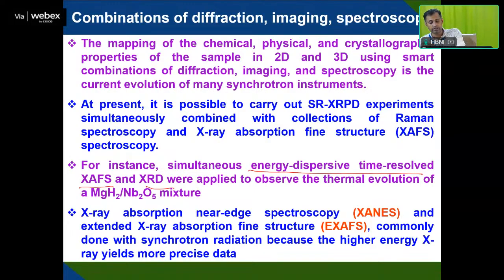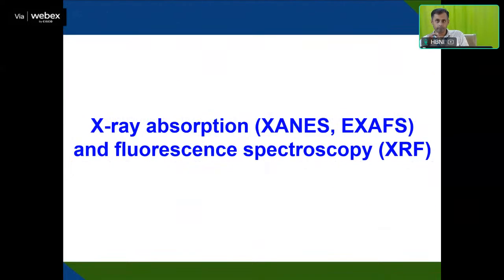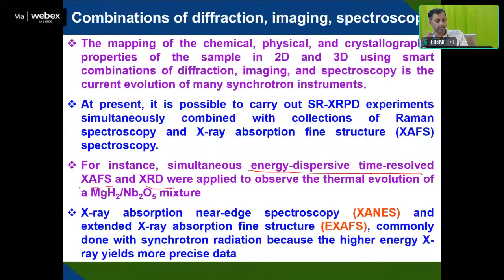In addition to this synchrotron XRD technique, we will discuss the X-ray absorption technique, that is X-ray fine structure spectroscopy. It is mostly divided into two: one is X-ray absorption near edge spectroscopy, and the other is extended X-ray absorption fine structure spectroscopy.